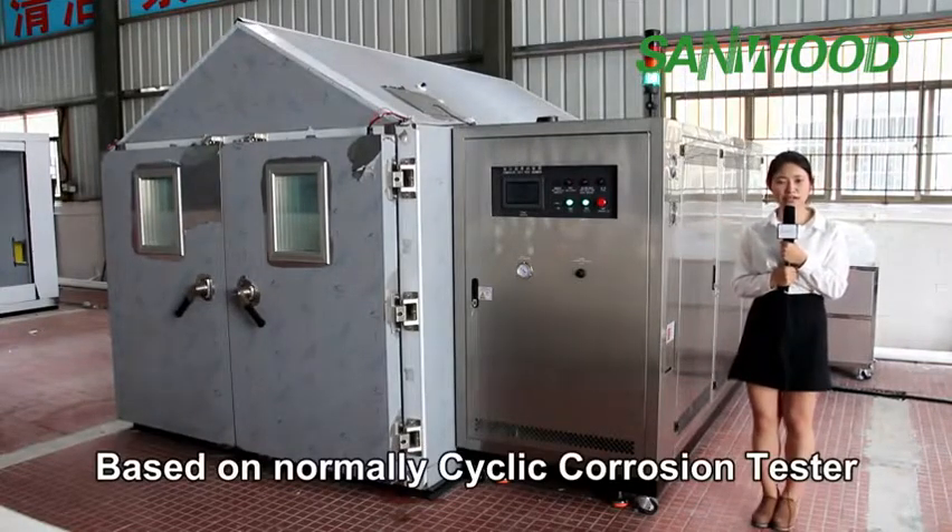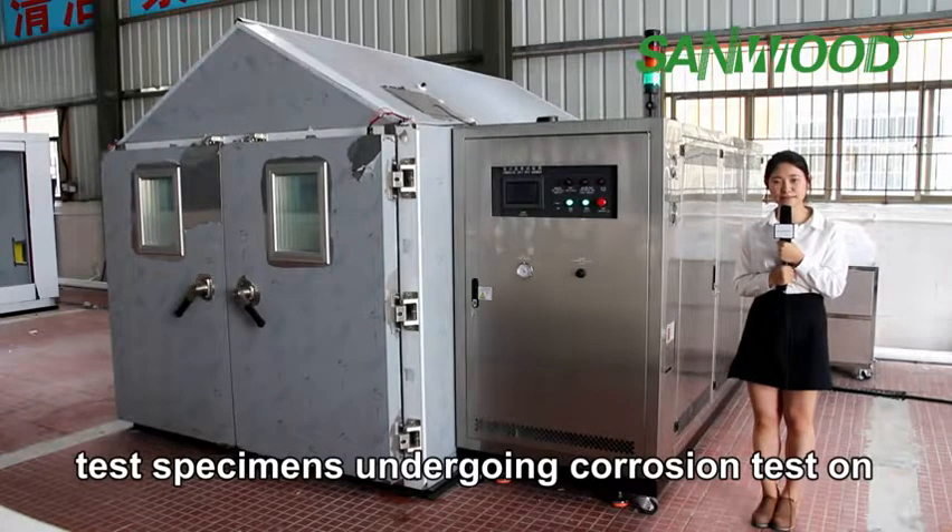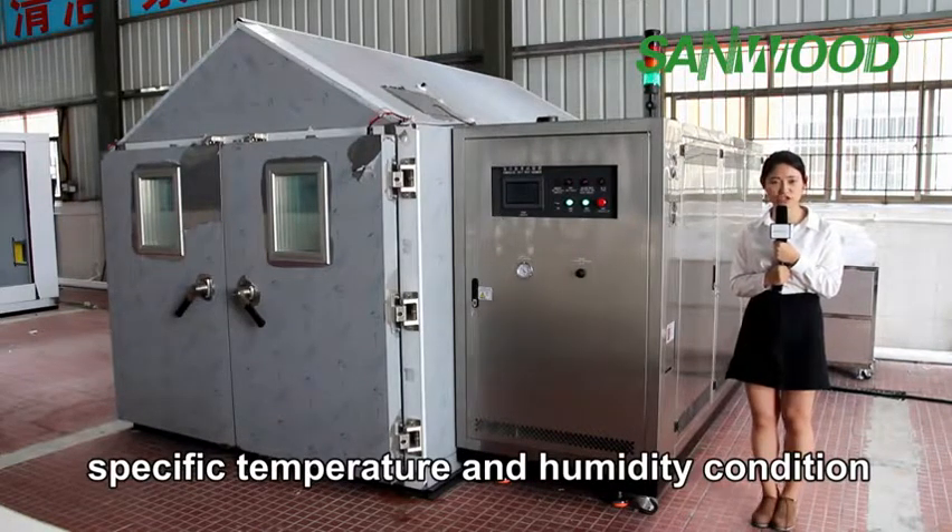Based on normal cyclic corrosion test, this one adds temperature and humidity control. Test specimens undergo salt spray testing under specific temperature and humidity conditions.